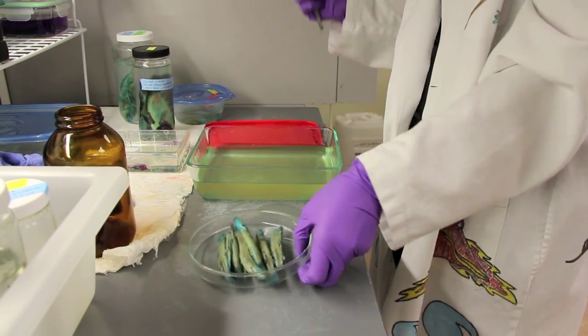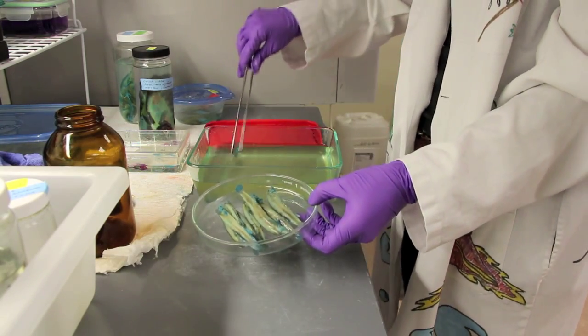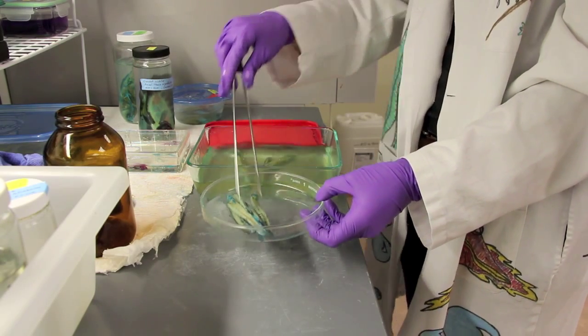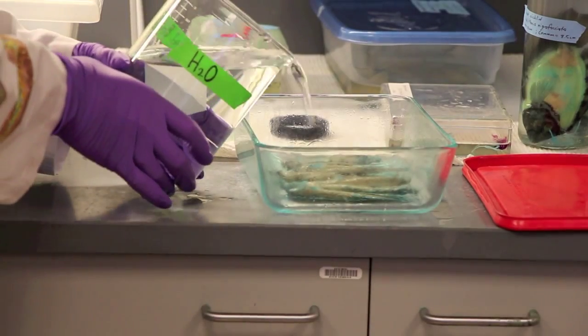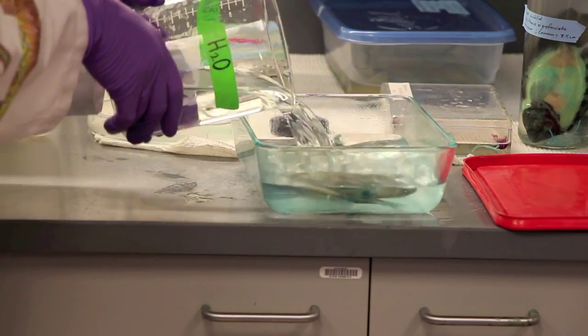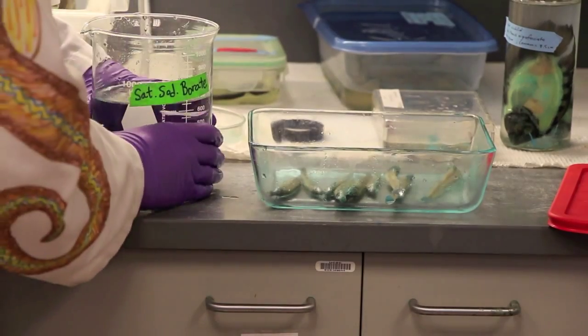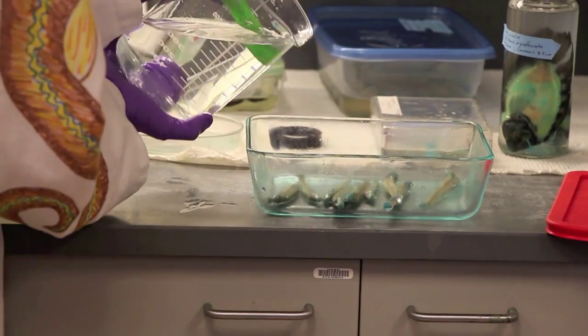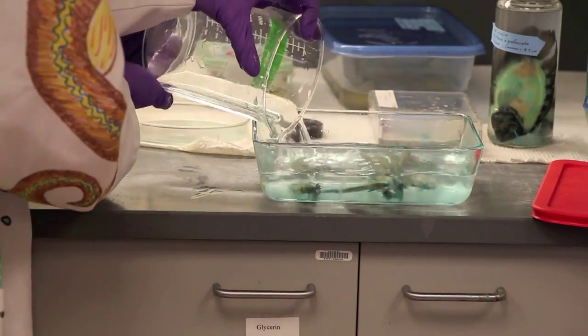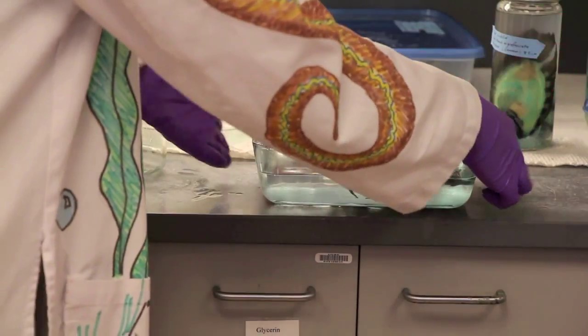Next, we place our specimens in a bath of ethanol, or ETOH, for a few hours, or even all day if the specimen is overstained. The next step is to place our specimens in water for a couple of hours. And then, we place our specimens in saturated sodium borate to neutralize them. This process takes 6 to 12 hours.